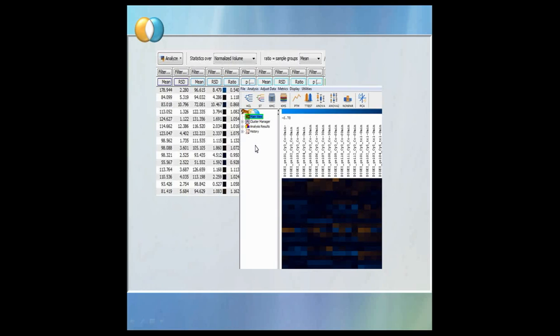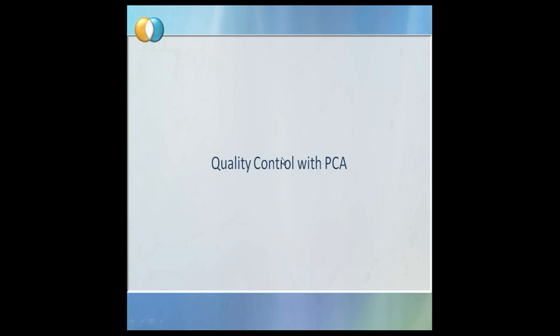This is just a basic possibility to analyze your expression profiles. The more advanced is the statistical toolbox, where you have access to sophisticated statistical methods such as clustering methods, Pavlidis template matching, t-test, ANOVA, two-way ANOVA, non-parametric tests, and also principal component analysis. Non-parametric tests become more and more important since they are the equivalent tests to t-test, ANOVA and two-way ANOVA without having the need of normally distributed data.